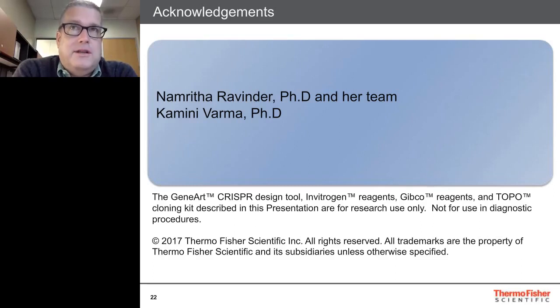Some of the applications that can be run, besides the genome editing techniques of Sanger sequencing and fragment analysis, include cell line authentication. There's clone checking of your plasmids, where you just want to sequence whether or not your plasmid construction is correct. There are methods for looking at inherited diseases by fragment analysis.